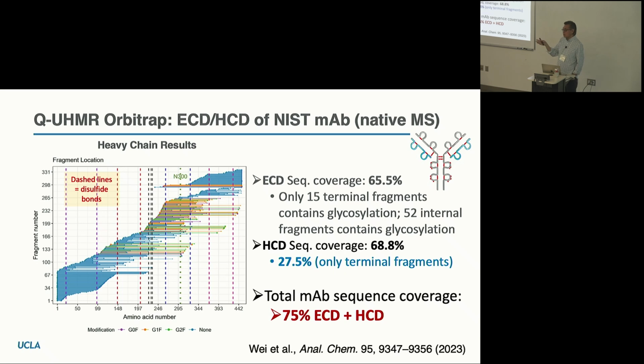Well, some of these lipids have charged polar groups. And so it could be that the charged polar groups are allowing it to stick to the gas phase protein so that I can still measure that interaction. We've not studied that yet, and so I would guess that completely hydrophobic molecules sticking to a protein would not be stable under native mass spectrometry. I would predict that, but no one's ever published that yet. But even things like hydrogen bonding and really weak interactions are captured. We've measured interactions at millimolar KDs, because there is a stable electrostatic interaction that still holds it together.